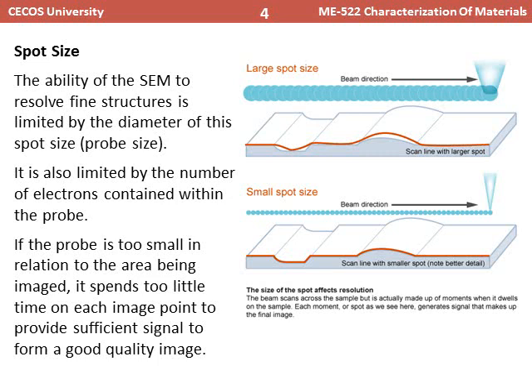Basically, the surface you are viewing in the scanning electron microscope has contours, up and down, up and down. The variation on the surface, or the surface morphology, can be easily resolved by varying the spot size.